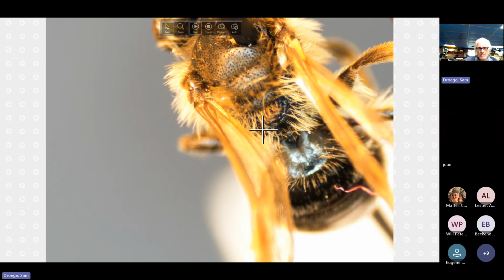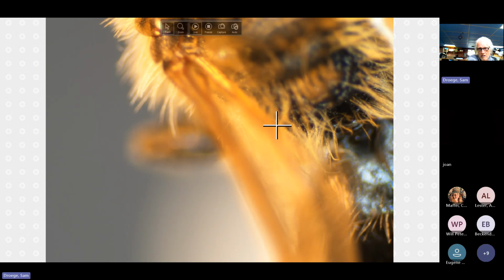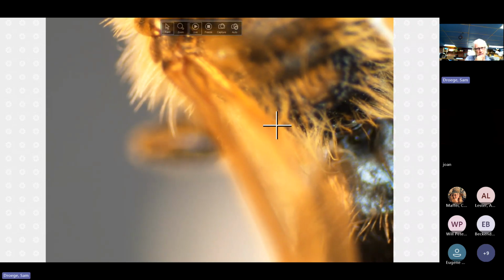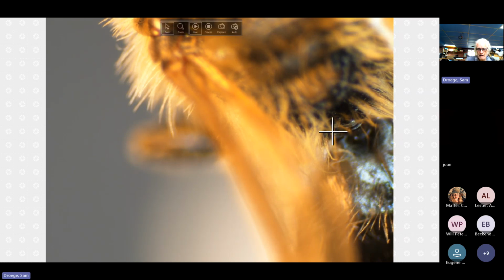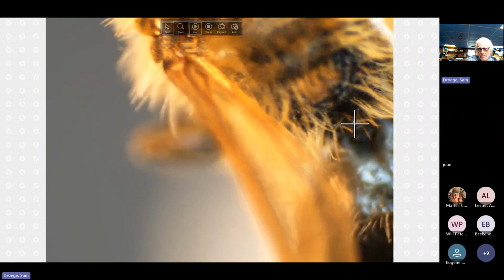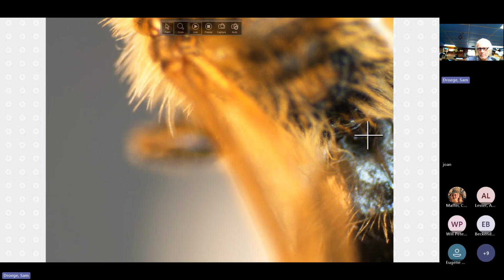Elysis can also have this propodial triangle, a raised line separating this upper surface, the dorsal surface, from not so much the ventral, but the rear-facing surface of the propodeum that is facing T1.